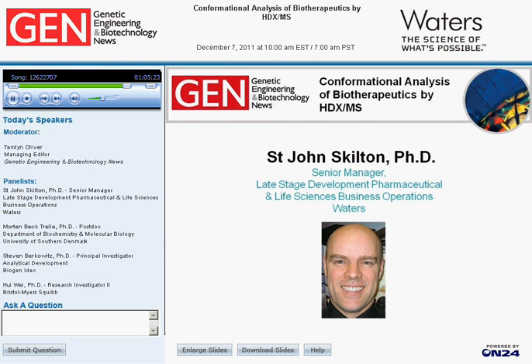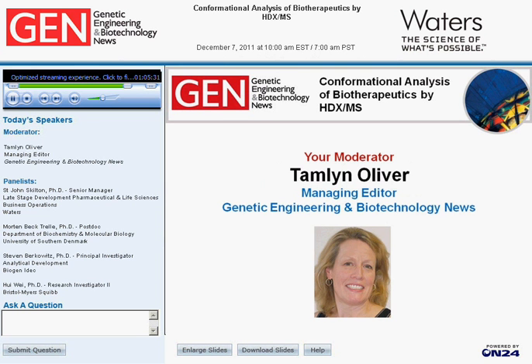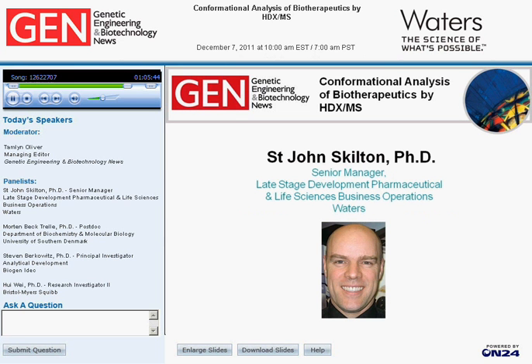Okay, St. John, I have another regulatory question. You suggest that this data can be submitted to regulatory agencies. Does this mean the software and methodologies used to produce and analyze the data are fully GLP compliant? Well, let's take a step back from that. We started off with this tool as a characterization tool. So at any stage, people have obviously been submitting HDX-MS data to the regulators as part of supplementary information and supporting information to their overall filings.